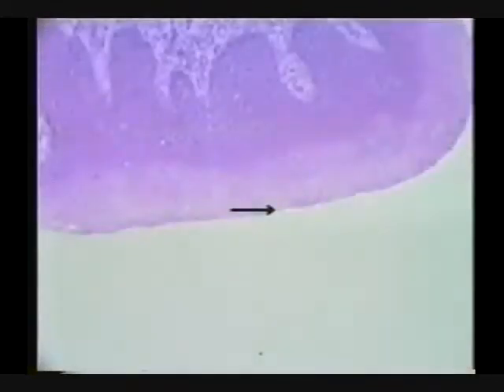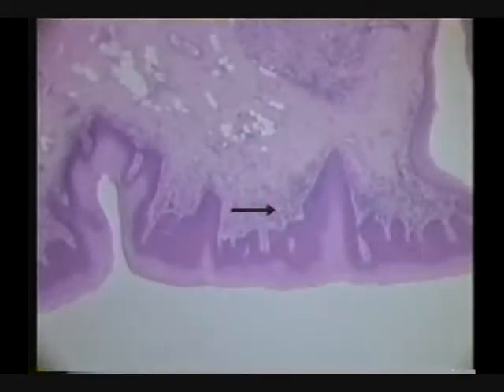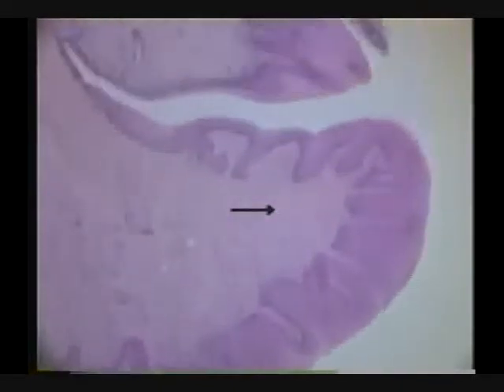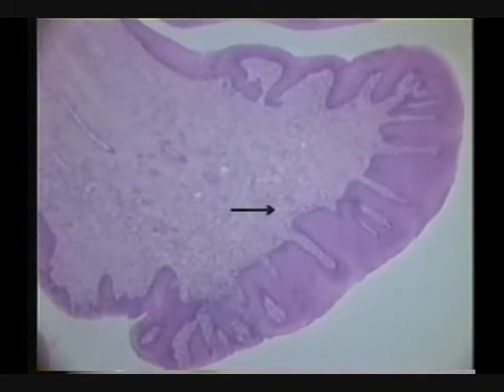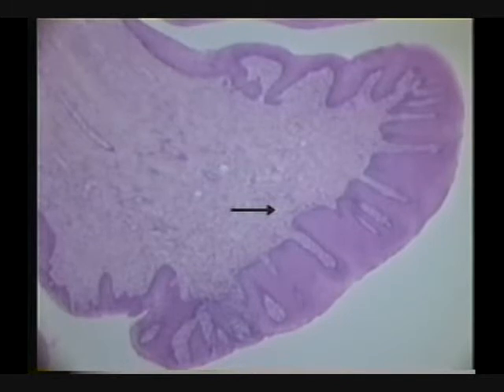If I might ask, in my way, identify the ugly organ in the field of view. That ugly organ is the tongue. Okay, look at this large structure filling the field of view. I'm on the lowest power here. Identify this large structure filling the field of view.